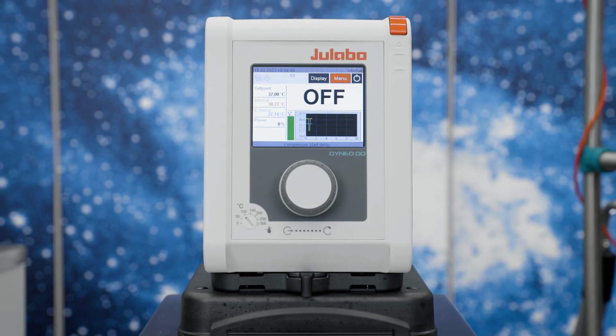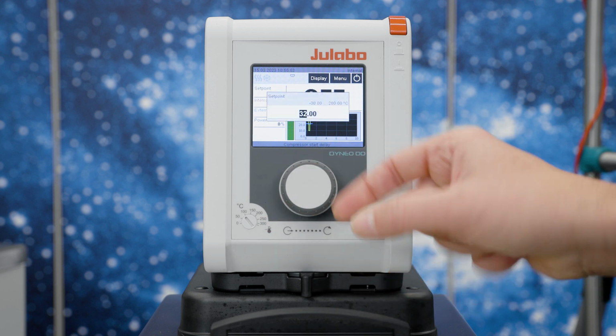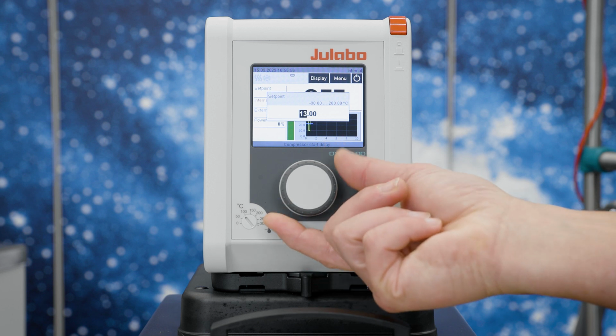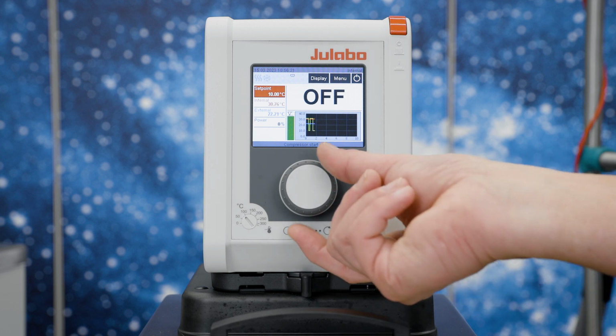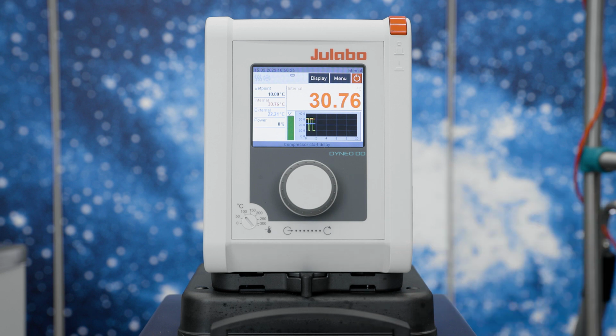You can simply change the set point by selecting the set point field. Press the rotary knob to confirm. To finally start your temperature control process, choose the Start and Stop button on the top.